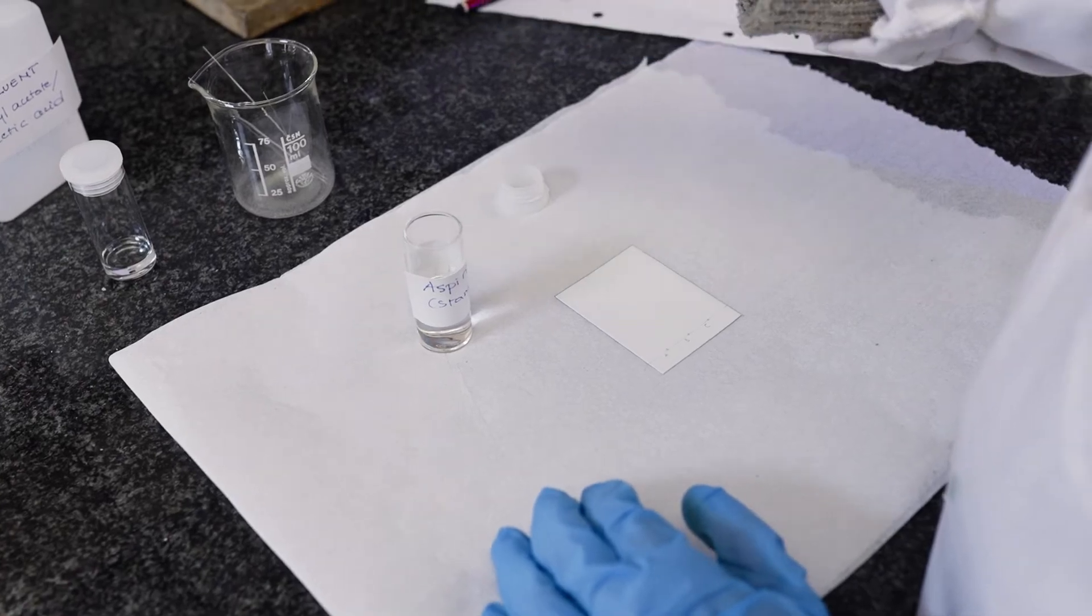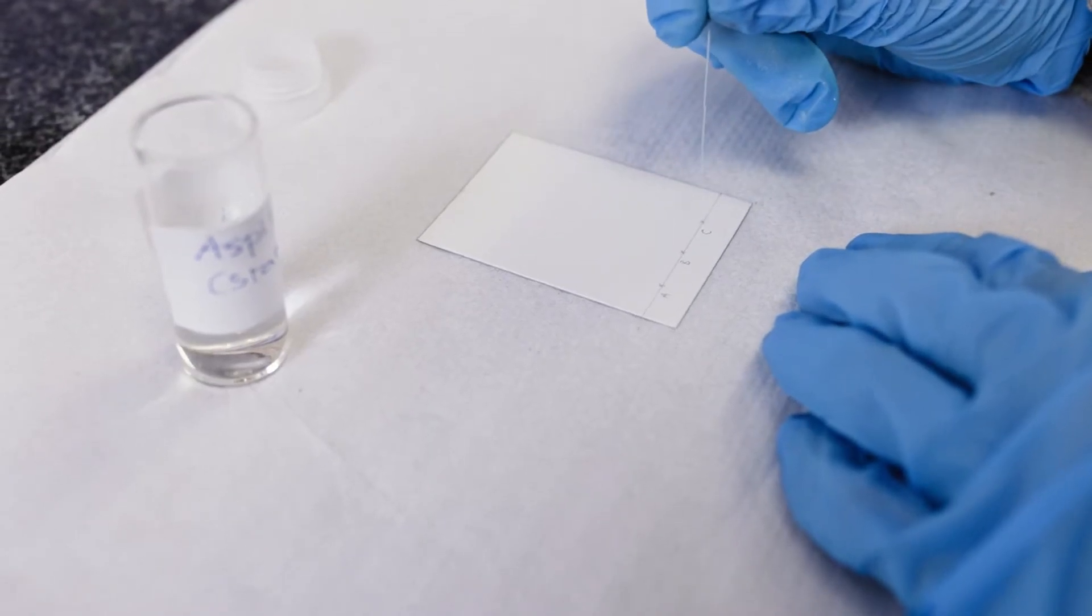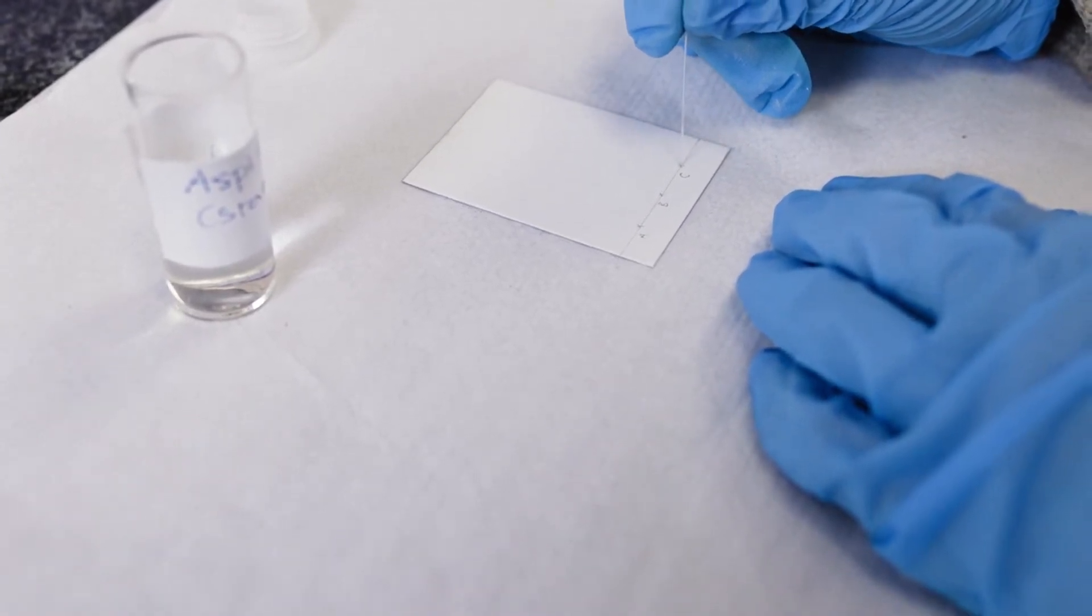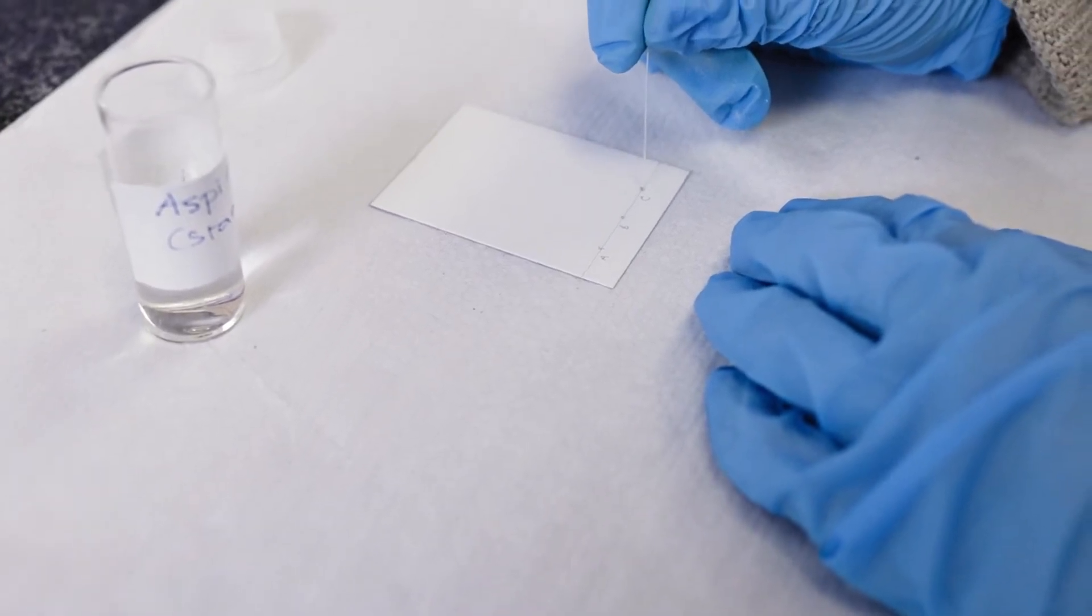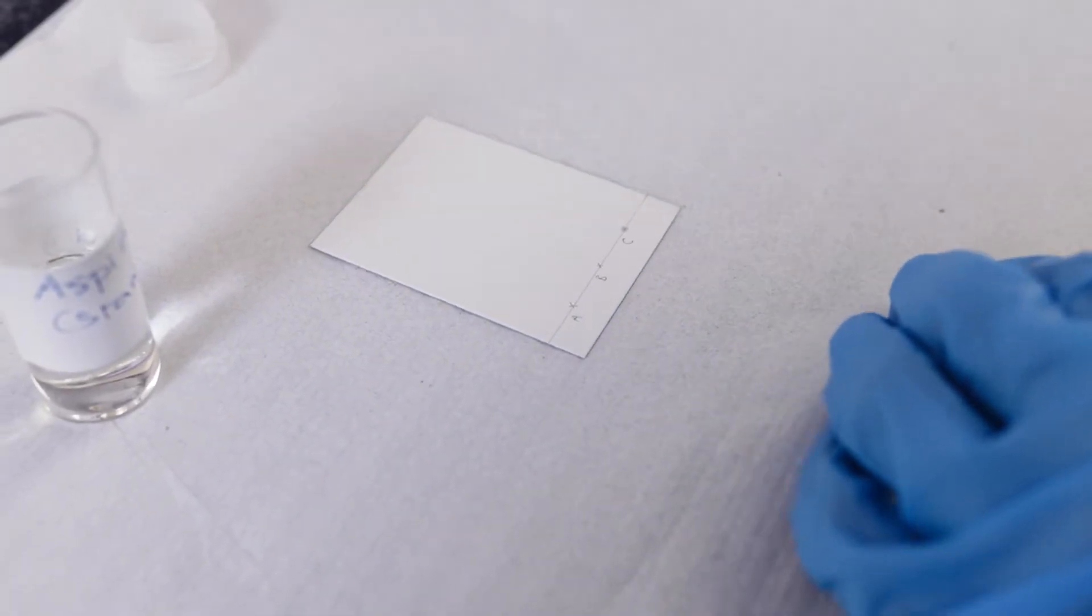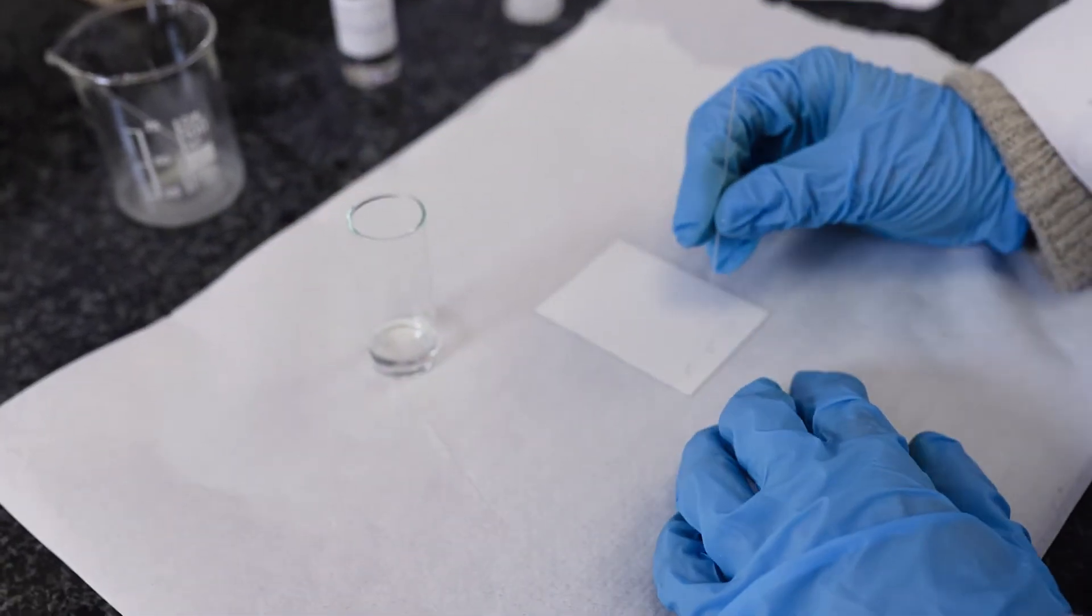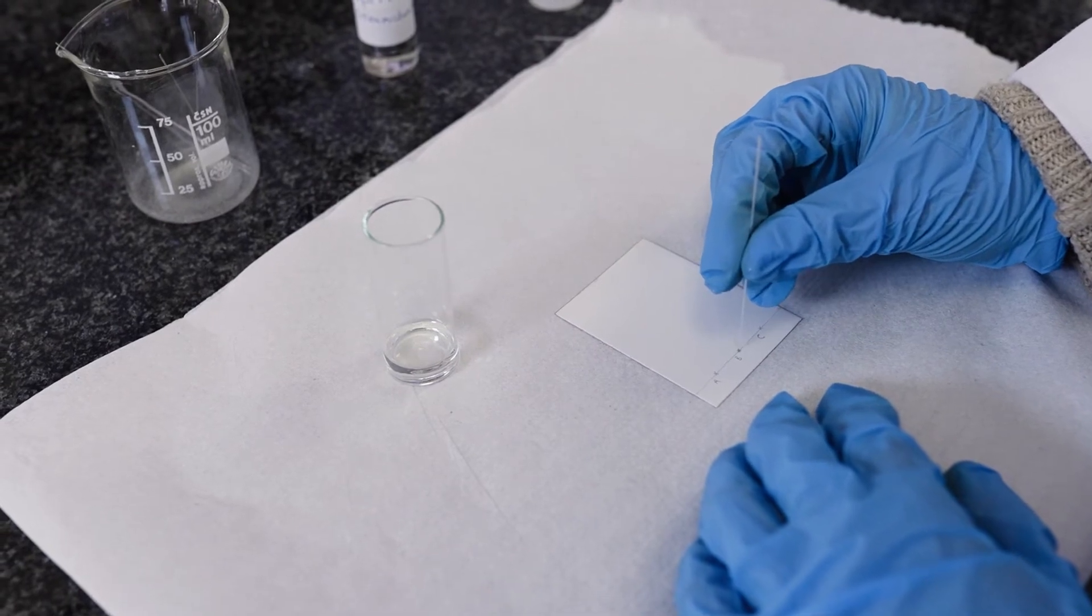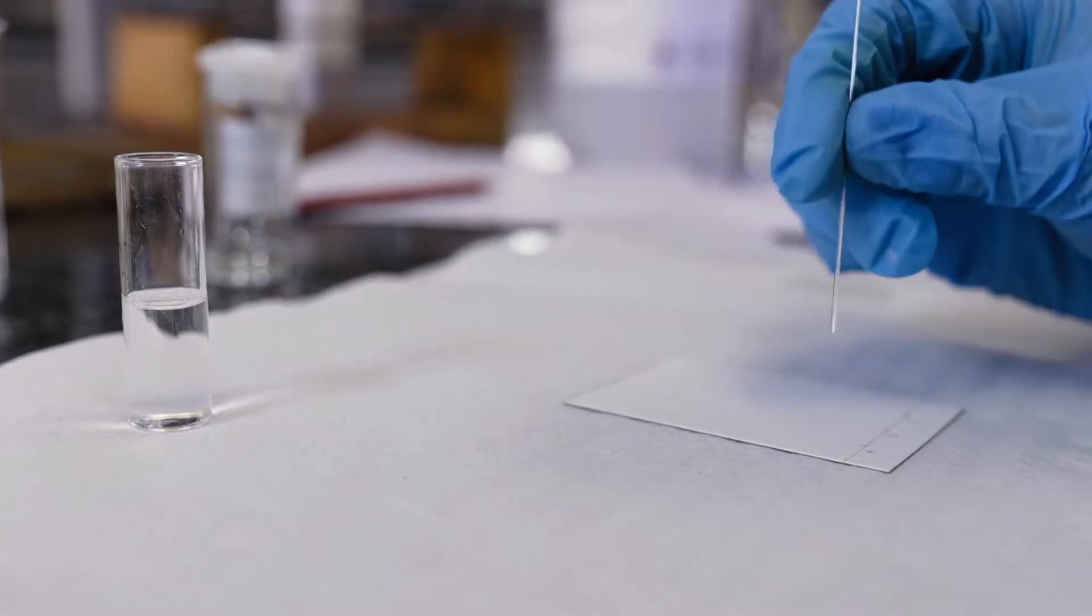So we just dip it into our solution and then we need to make sure that the capillary tube is upright when we spot it. So you'll see there's a little dot that forms, and we're going to do that twice to make sure we've got enough solution on our TLC plate. So now we're doing our homemade aspirin, and this is salicylic acid.